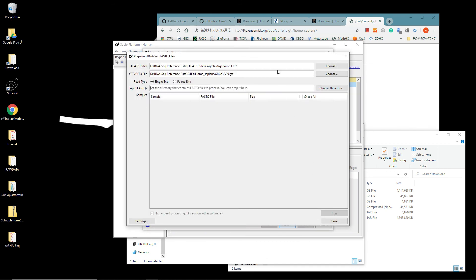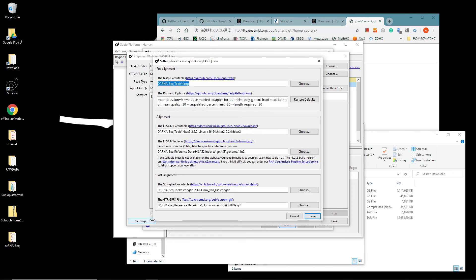You see the Execution panel. If you want to open the Settings panel, click the Settings button at the left bottom corner.